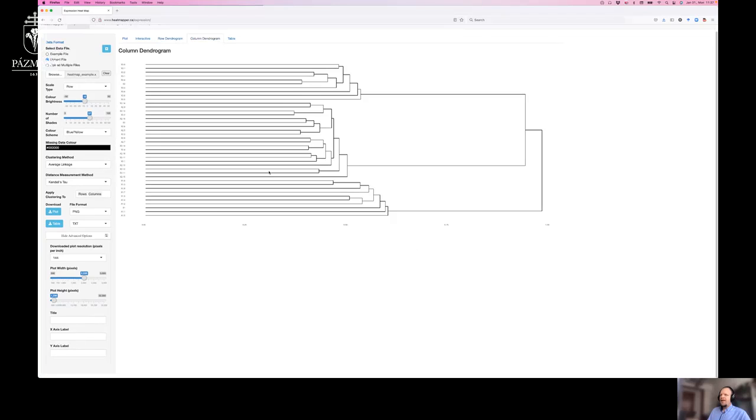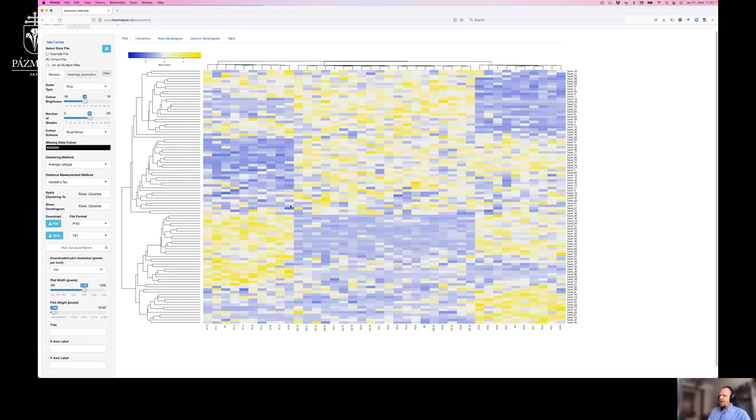Okay, let's look into a group of the samples. Here we can see some nice clustering. The first group is this, the second group consists of these samples, and the third group is this. So what we can obtain from the original plot is that, based on the data, we could well recover our original groupings.